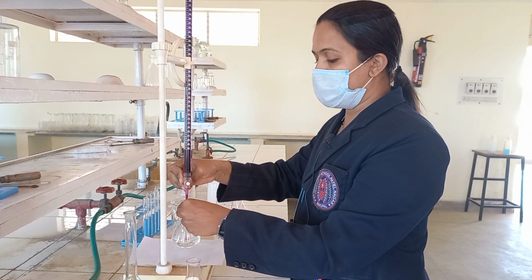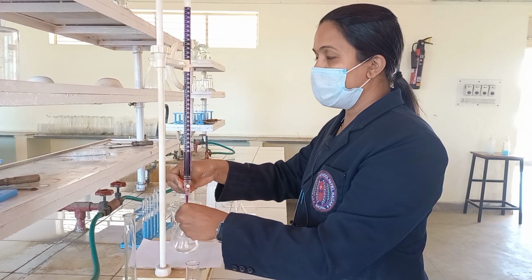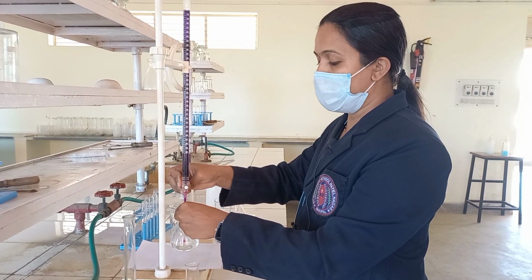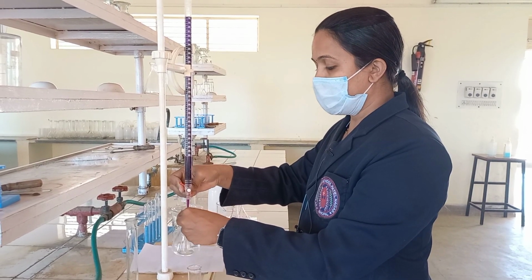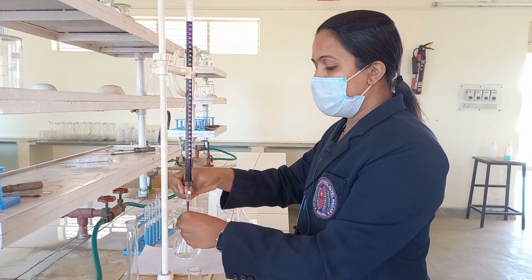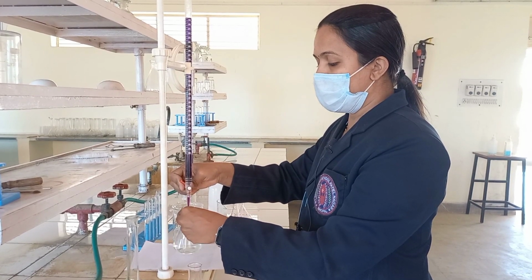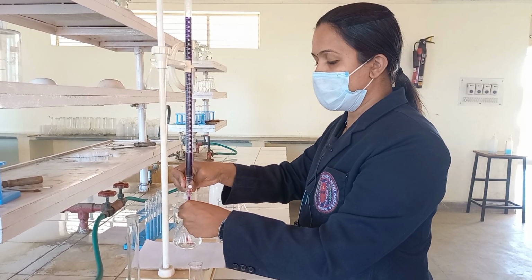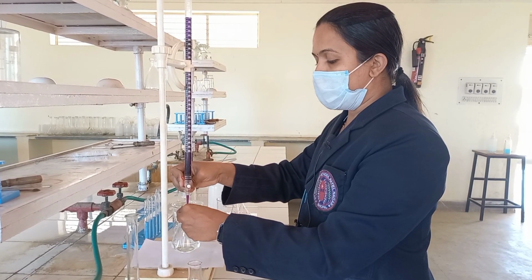Then after some time you will observe that again I will get the light pink color. This time you should be very careful, because the first time we got dark pink, but the exact and correct reading is the light pink. So I'll show you which one is the exact and correct reading. If you do it in this manner, your result will be accurate, and after taking the reading you can show this result to your internal as well as your external teacher. Right, so while doing it, be careful.